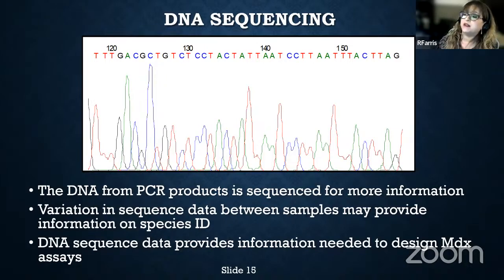I have spent countless hours going through sequence data and editing sequence data, because this is a very clean example that I'm showing you. We don't always get this lucky. Sometimes the DNA is very messy. Sometimes the peaks don't look as clean. Sometimes we get double peaks.